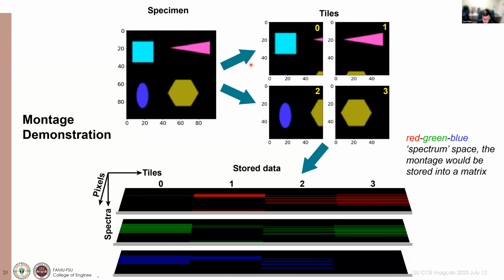but also depending on your stage. And so some noise or background, or maybe the sample is drifting, those kinds of things can really affect your data acquisition. But regardless, after you get this final image on the top left here, you will be able to stitch these four. The idea is if you just get a low mag image, you won't be able to resolve all these nanoscale details.